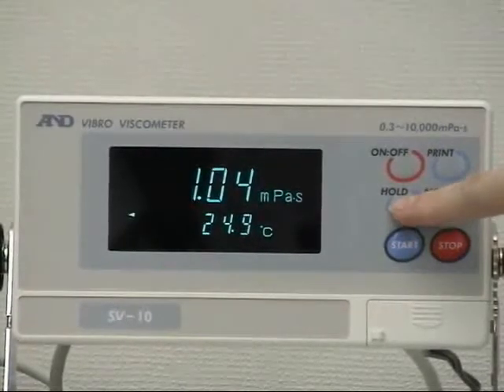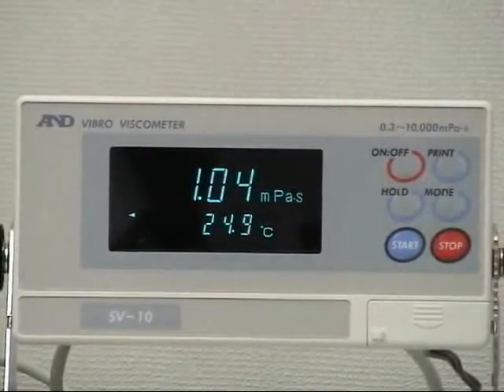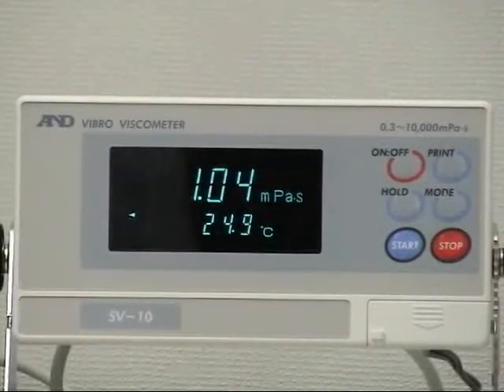During the measurement, press the hold key to freeze the display temporarily. The hold indicator will appear on the left side of the display.